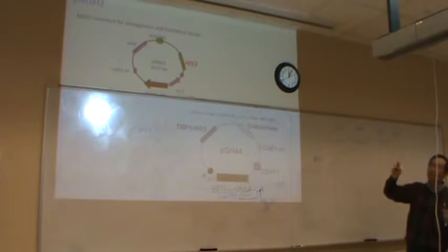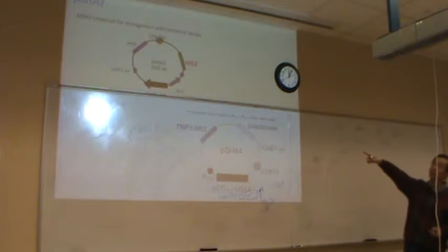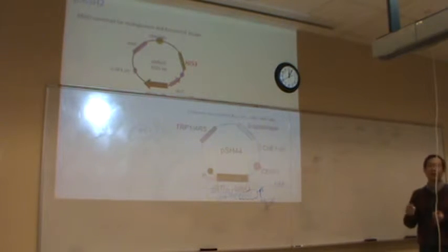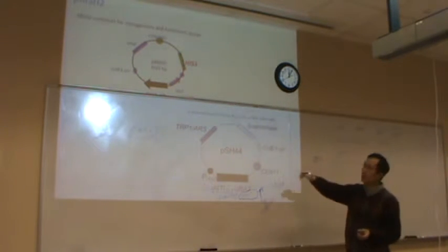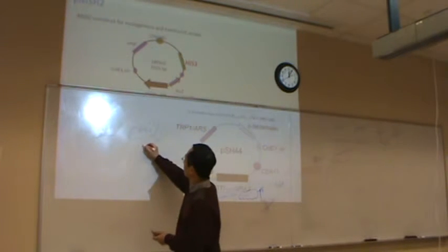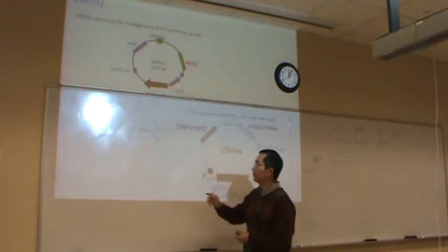You see the point? If we don't even put the plasmid there, the cell basically won't live. And of course, then what's the point of a better function? So it's actually just the opposite. And in our case, if we just put the vector there, MSH2 will be that deletion. There's no MSH2. There's no MSH2.